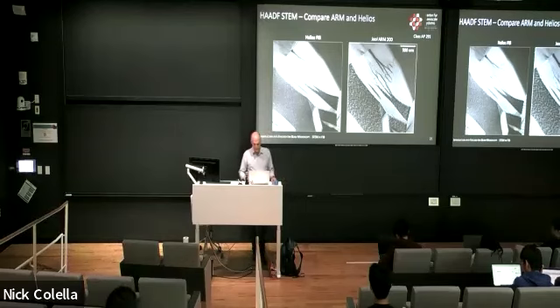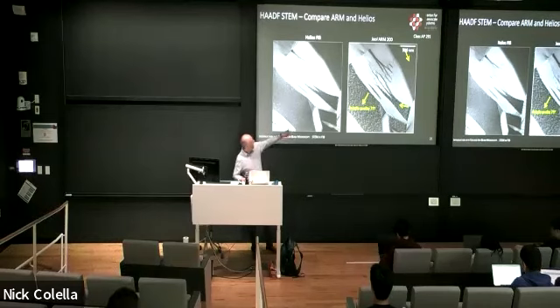But we can technically use the STEM to get a first quality assessment of the sample before going into the actual TEM. So I would like to direct your attention to this dark gray area, which shows this kind of model structure.